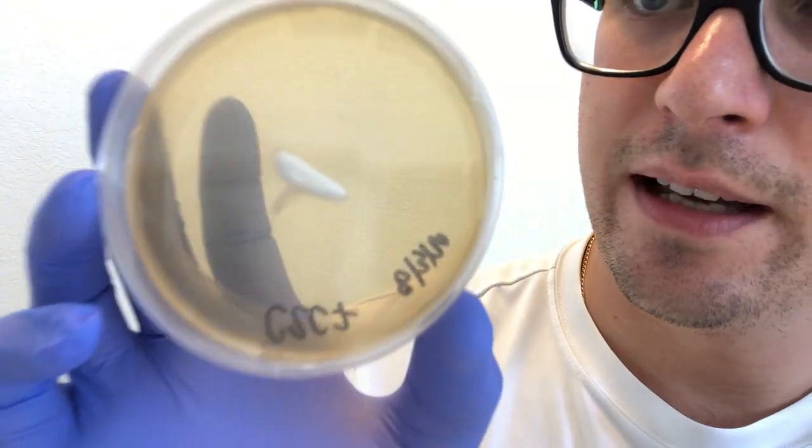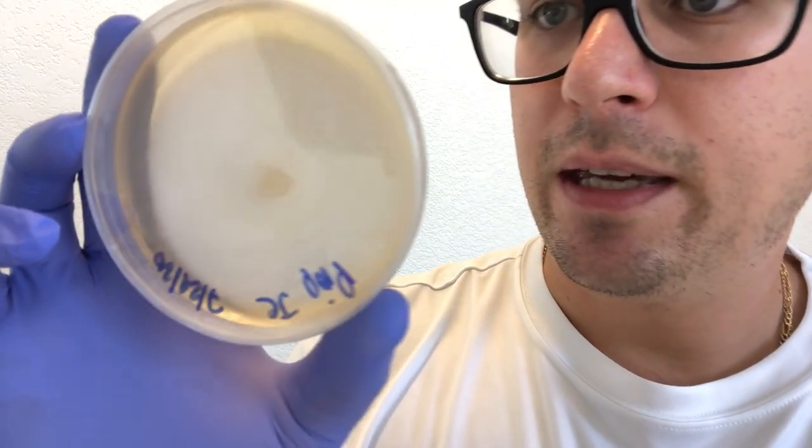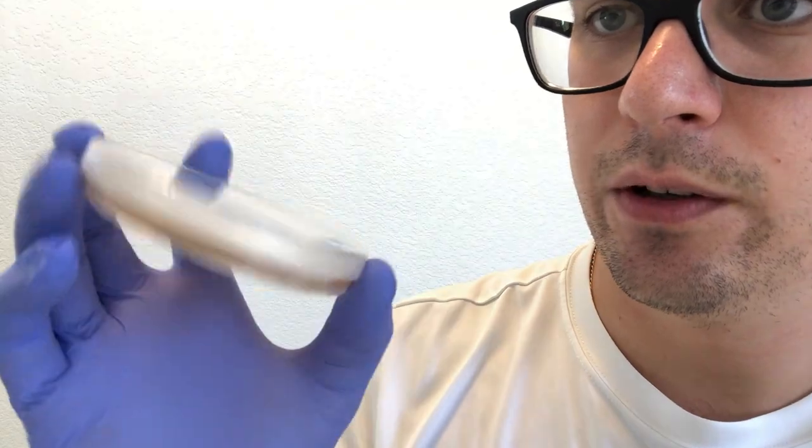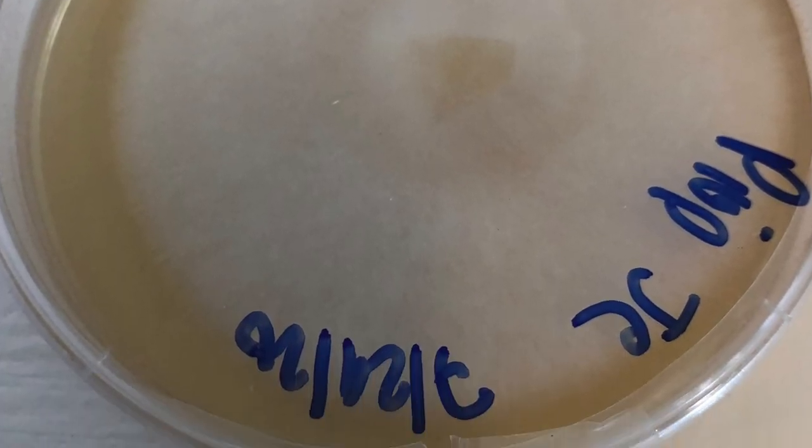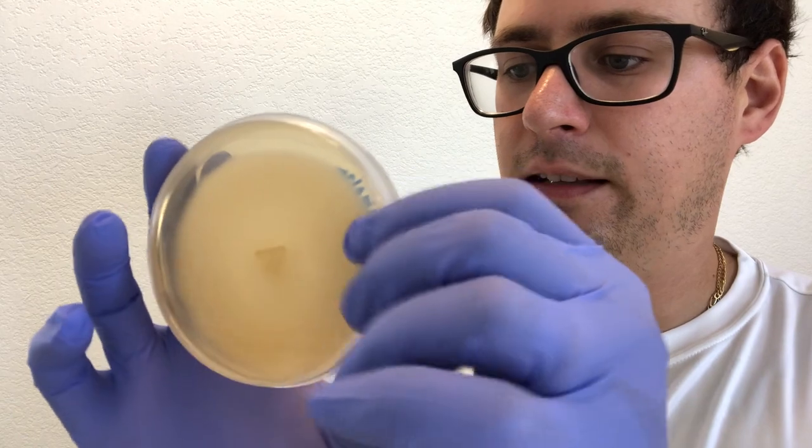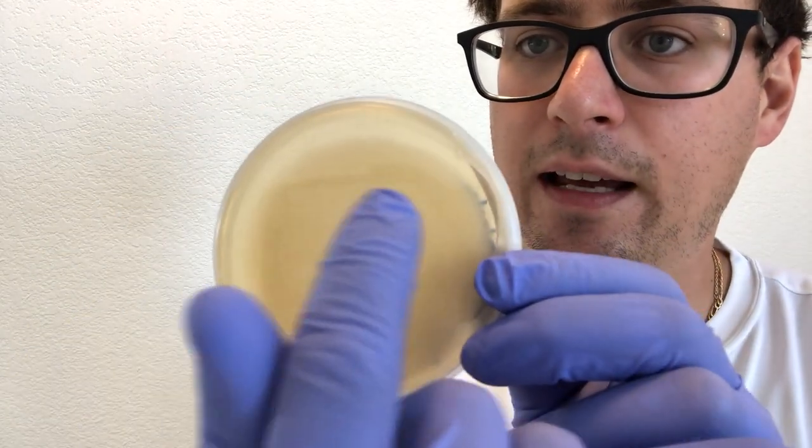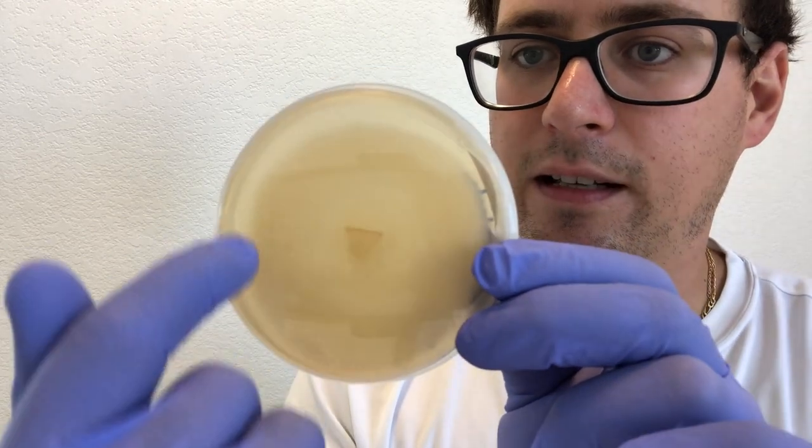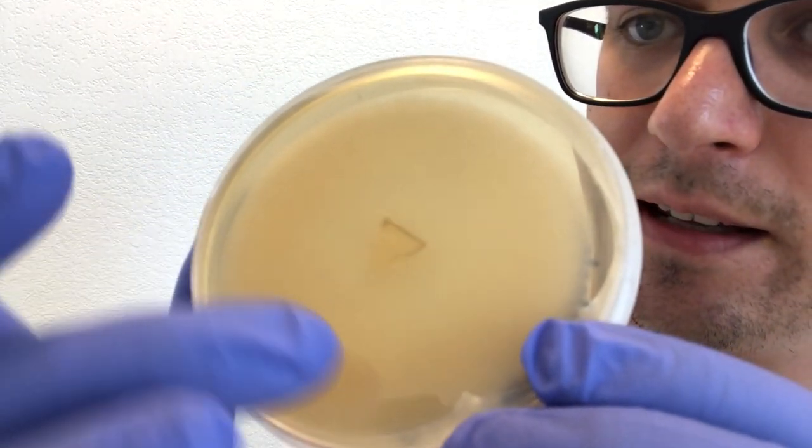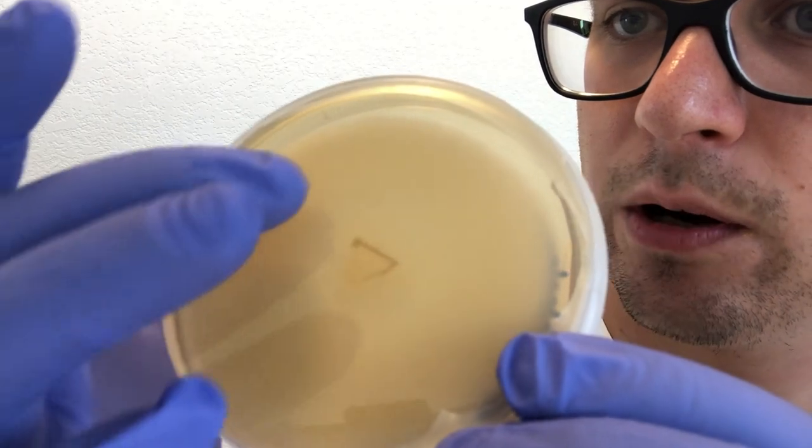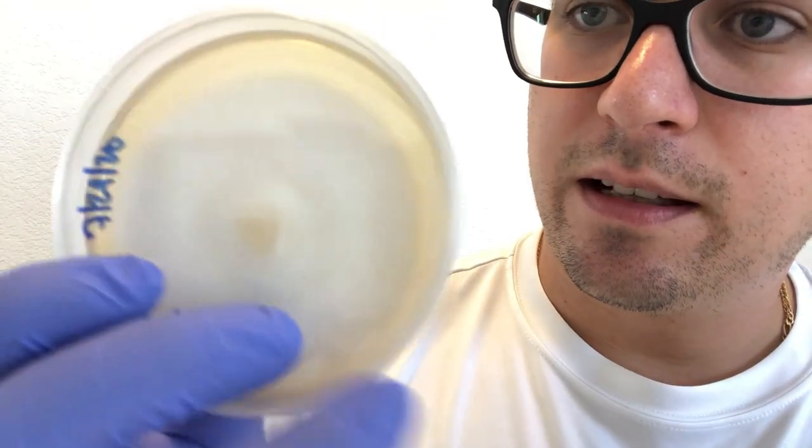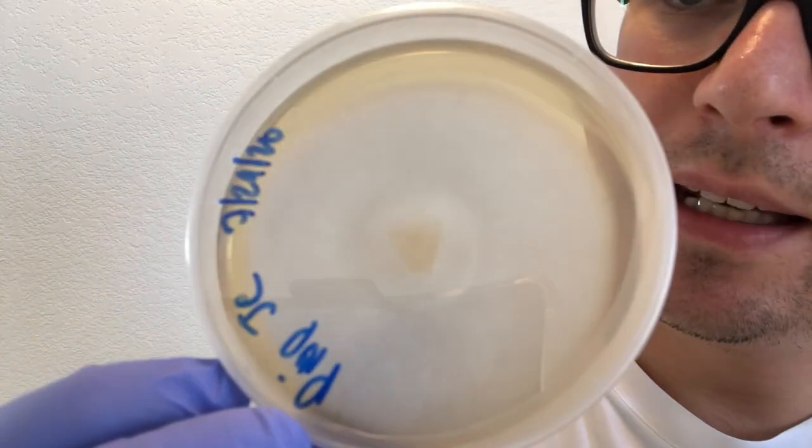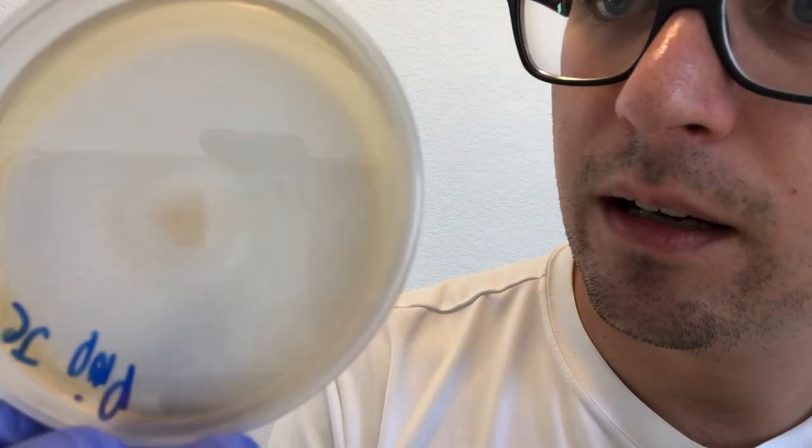Next we've got some pioppini. You can see how beautiful, nice and round. One of the things that I do to double check that there's no contaminants is making sure that the bottom of the plate is nice and clean. Sometimes if there's yeast or bacteria hiding in there, you'll see small round blotches or blobs. This one looks very clean. It's a pretty standard pioppini—very dense, cottony, just like the beech mushroom but a little bit more flat.